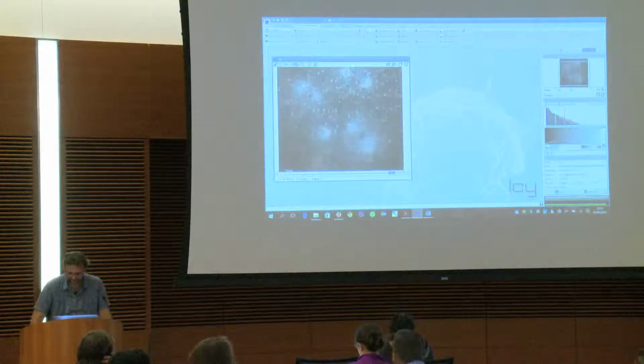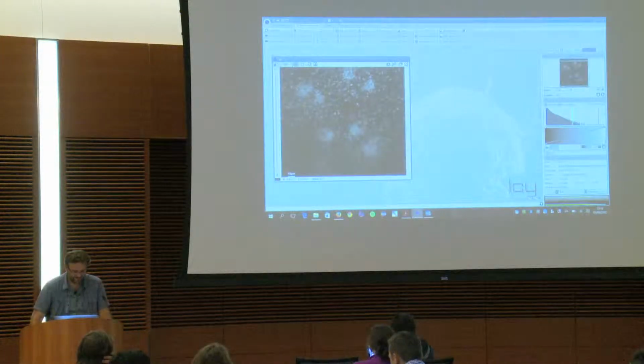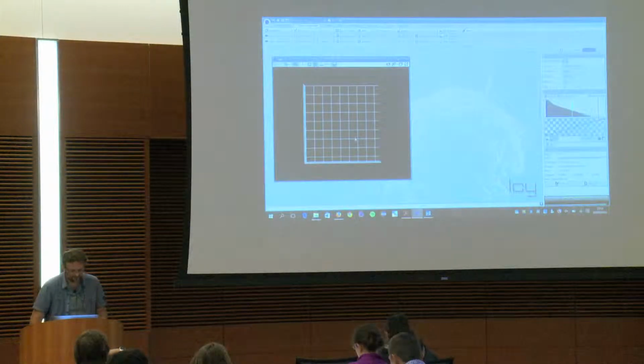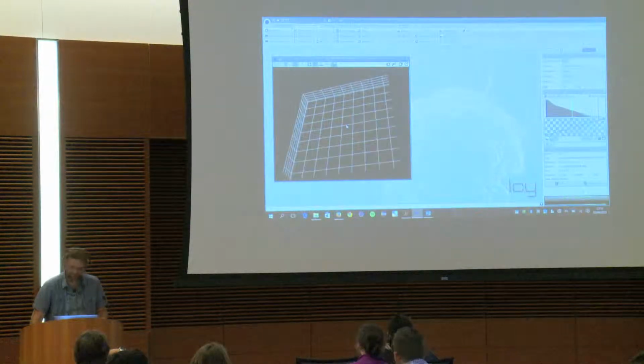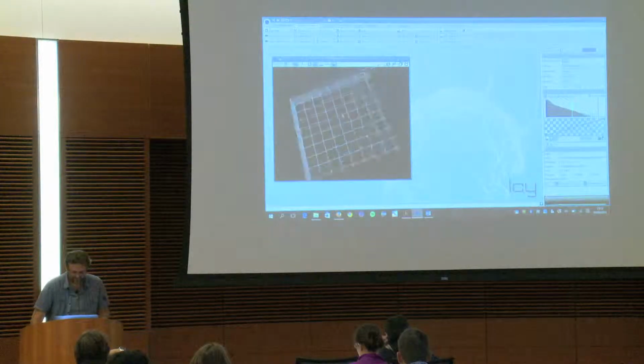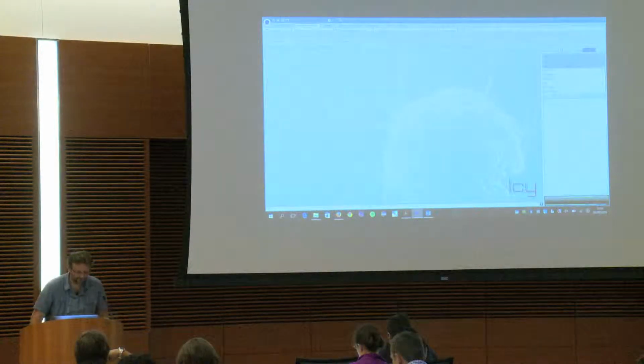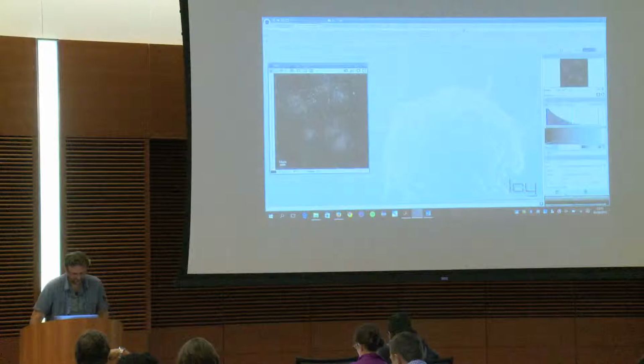Okay, so if you put it back as a stack, here you can switch to 3D just by clicking in this box. So I click to 3D here, and now I should have my 3D rendering. So I'm going to complain. Oh, why? Oops. Sorry, I close it. Try again.